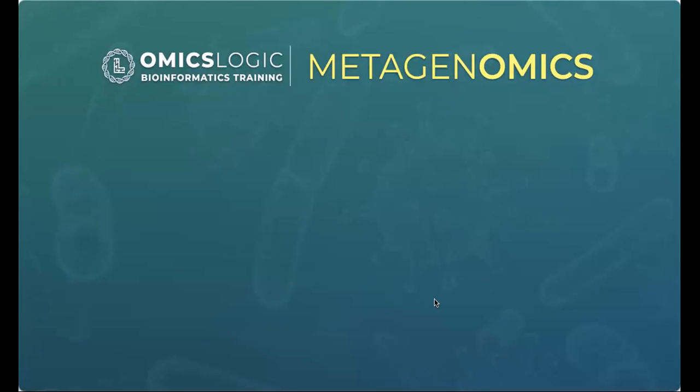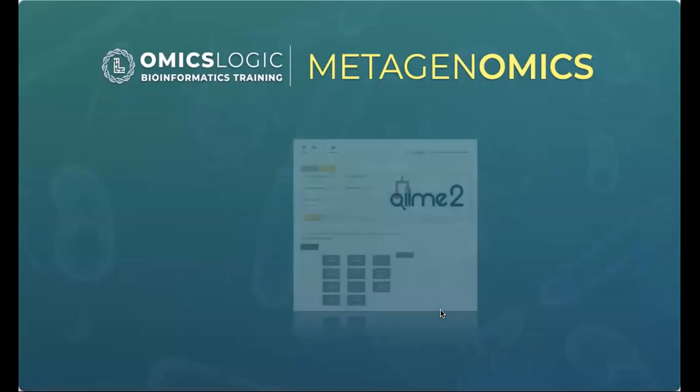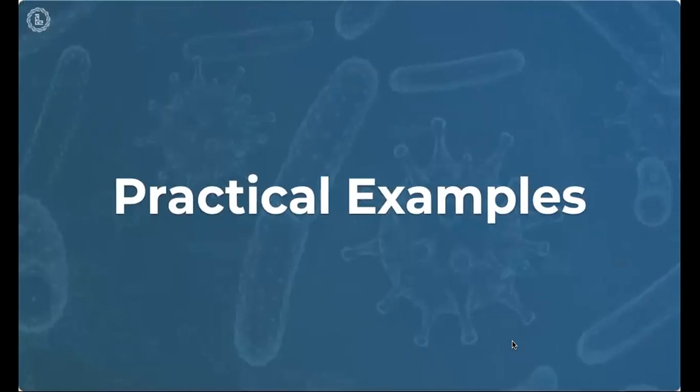For the next session, we are going to talk a lot about practical approaches, which includes application of amplicon sequencing using several popular analysis methods like DADA2, QIIME, etc. We will look at how to set up this analysis practically on the tBioInfo server, what parameters need to be considered, how to extract data from publicly available resources like NCBI or from publications, and how to get hold of resources that we have identified and tabulated, which could be helpful for the projects you are focusing on.